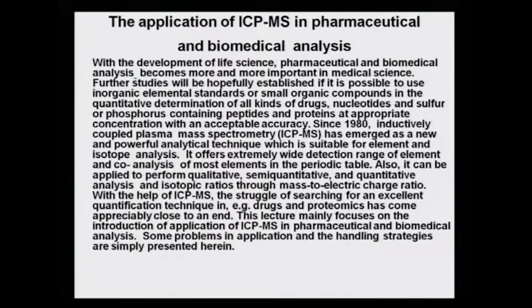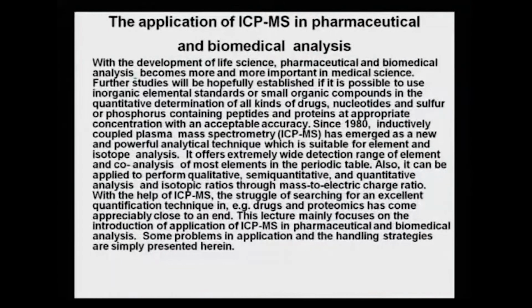Then coming to the use of ICP in pharmaceutical and biomedical analysis. As I said, every time there is a new type of sample which has complicated matrix, there is a challenge for the analyst to design a method which should extract all the ingredients, and therefore, only the efficient analysis or data can be obtained. With the development of life sciences, pharmaceuticals and biomedical analysis, it becomes more and more important in medical science to be able to utilize these techniques and to analyze the analyte.